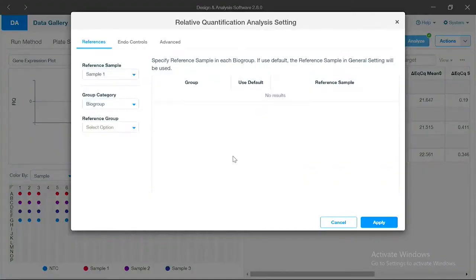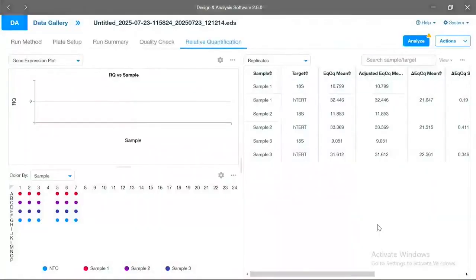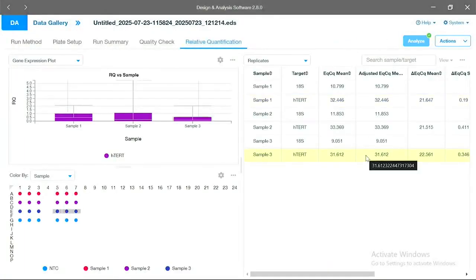That's the lovely thing about all of this data: whatever you're doing, it saves the raw data in the file. You can do all kinds of different analysis. You can even recover data from unassigned wells. You're going to collect all the data across the whole plate, and you can change whatever kind of analysis you input on that at any point in time. So let's apply this. And now we get some plots.